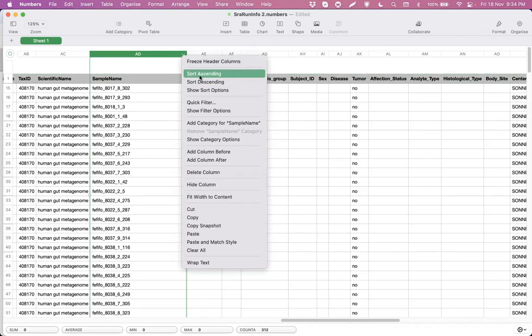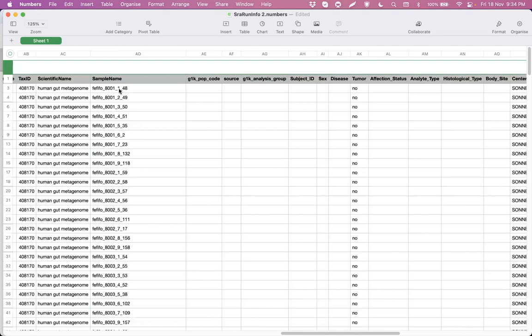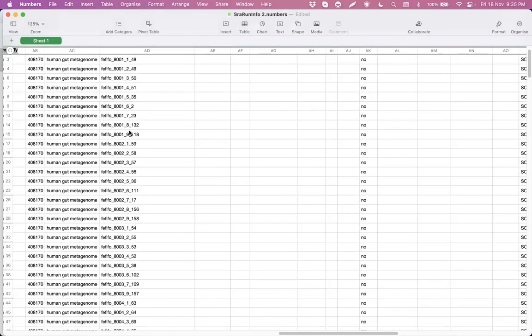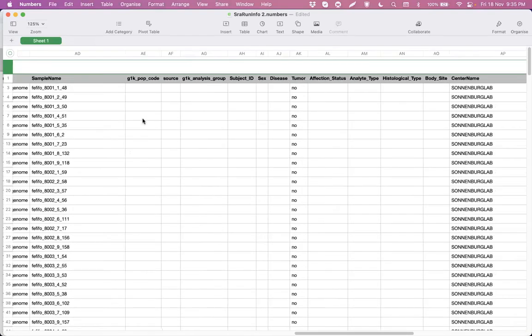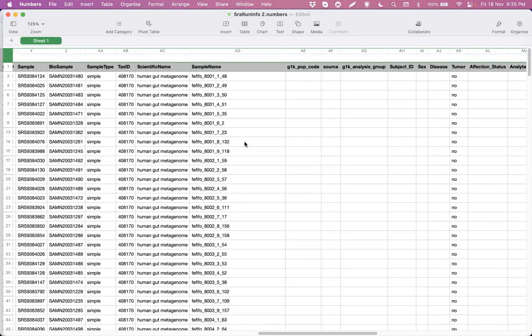Sort ascending or descending, whatever it is. Yes, okay. You see that this is sample 1, and this is after first week, after second week, after third week, fourth week, fifth week, sixth week, seventh week, 8 and 9. And that's how each and every sample goes. So you can take different time points and then get that specific data, and you can start quantifying them, right?